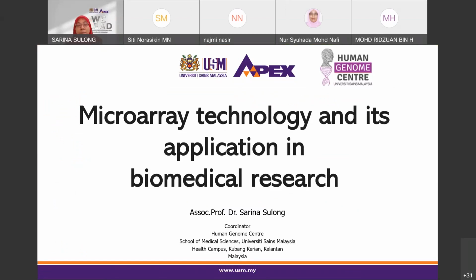My presentation will be focusing on microarray technology in biomedical research, particularly in genetics or genomic research. I will introduce the general information about microarray, and then focus on DNA microarray, its application, and a few things related with microarray data analysis.